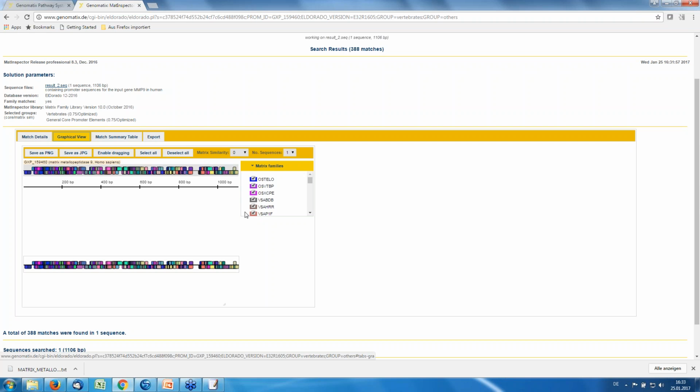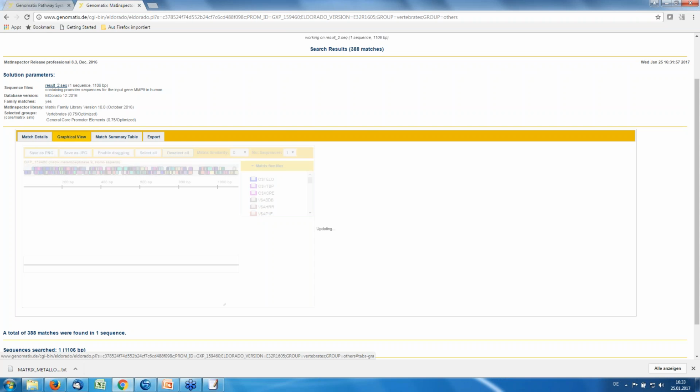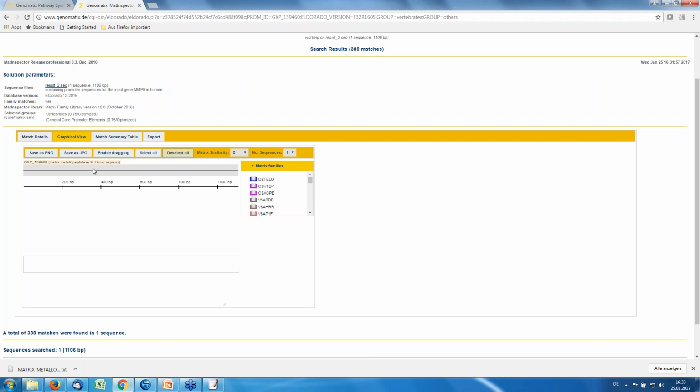If you want to see only these AP1F binding sites, then you can deselect the binding sites here and just select from the list that we have on the right-hand side, AP1F, and you quickly see that we have a binding site here with a match on both strands and another one here also with a match on both strands with some additional information. I won't go too much into the details here, just to show you that you can quickly get from the network to the transcription factor binding site analysis of the corresponding promoters.